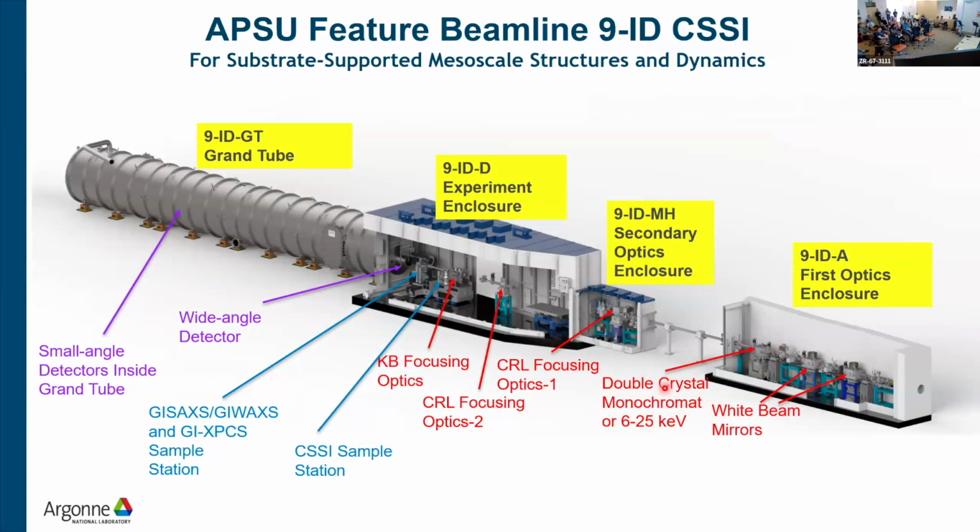Okay, since I'm an experimental scientist, I want to talk about experimental beamlines. Hopefully you're still awake; I talked about too much theory here. Anyway, I work a little bit on XPCS, but I'm mainly responsible for this CSSI beamline. This beamline is still under construction.